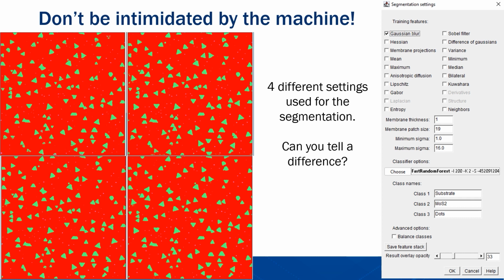I'll just lastly point out that, as I mentioned, this is a user-friendly tool. You can certainly dig into the tool itself, just as probably most drivers don't know how to rebuild their engine in their car. You are probably an okay driver, but when using this tool, you don't necessarily need to know the inner workings of every single function. Of course, it helps to know how your engine's built. If you have a catastrophic failure, it's beneficial to know how to fix that. However, it's not required.